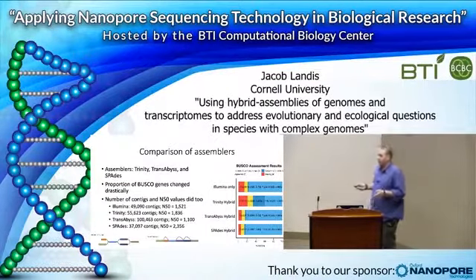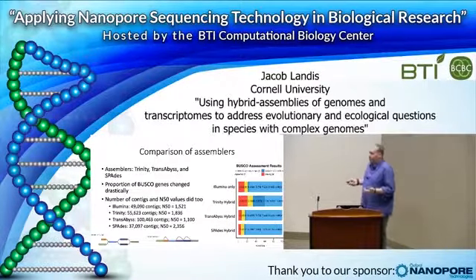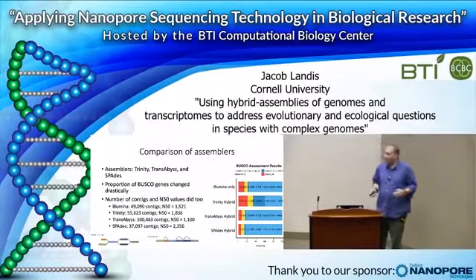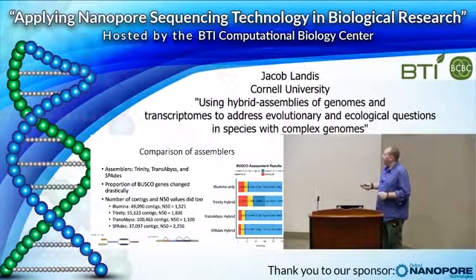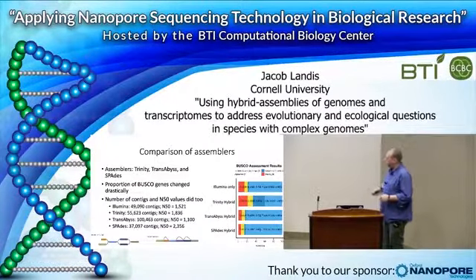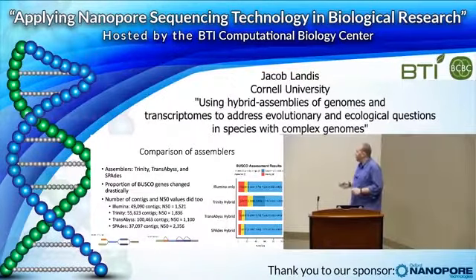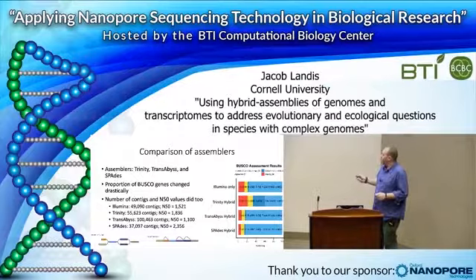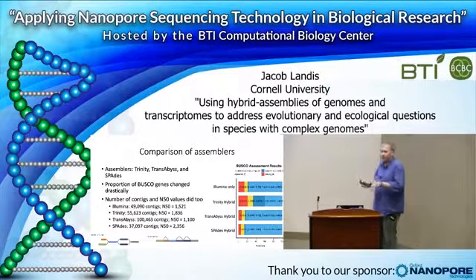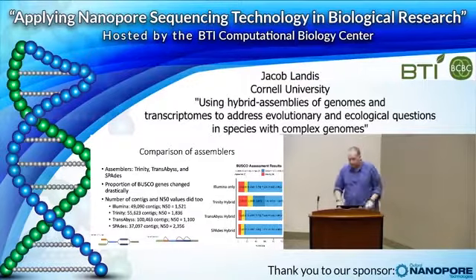So we do see changes in BUSCO genes and also changes in the number of contigs and the N50. Part of the difference I think we see in the number of contigs is how some of these programs deal with different isoforms or different splice sites. So you may have this transcript splice site here, and things can come together in different ways. At least for Trinity, using the SuperTranscripts option, it makes one transcript and puts it together, so you can use that to map things to. So that's a little bit of the reason we have some different number of contigs in this assembly.